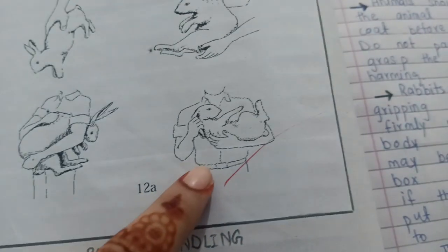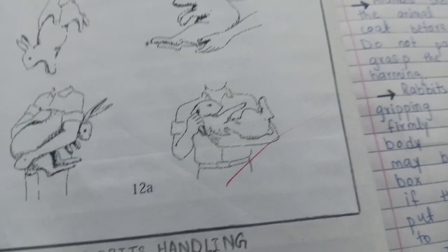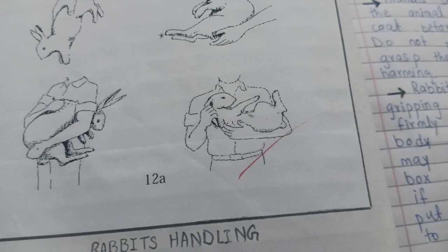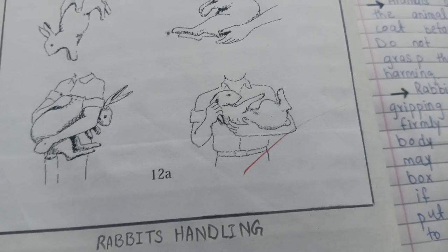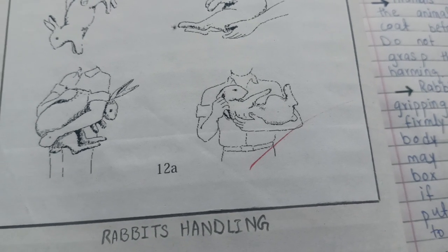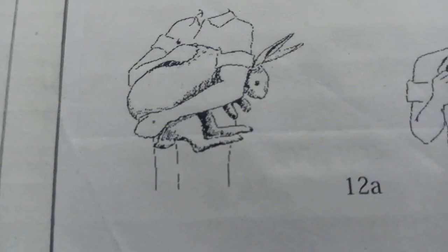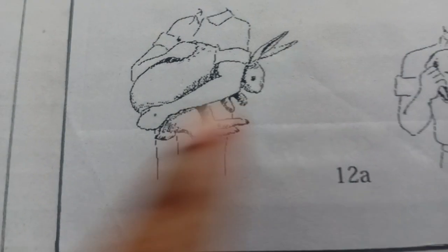So this is a comfortable position. This position is also comfortable, where you keep the rabbit close to your body. It makes the rabbit feel more comfortable, and it will not bite you. This is a comfortable position. Same, this position is also a best way to handle a rabbit, and it also protects you from the rabbit's bite.